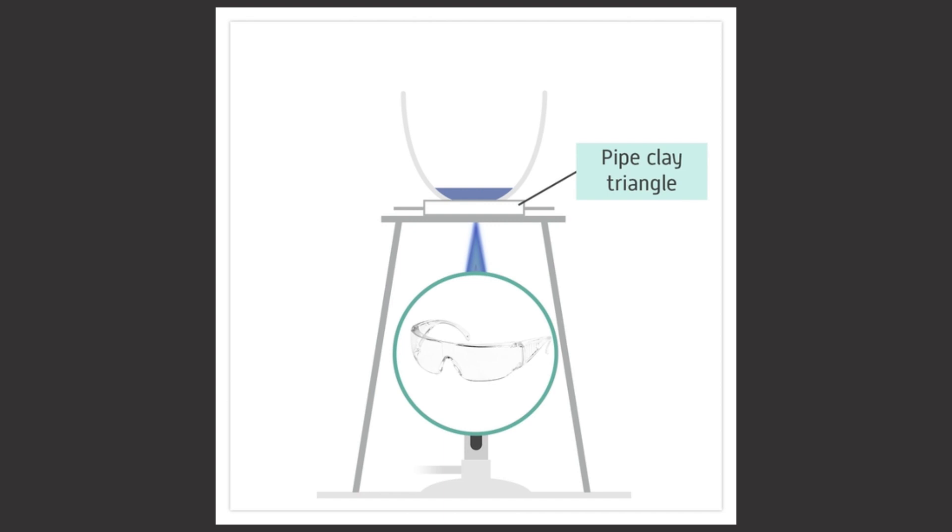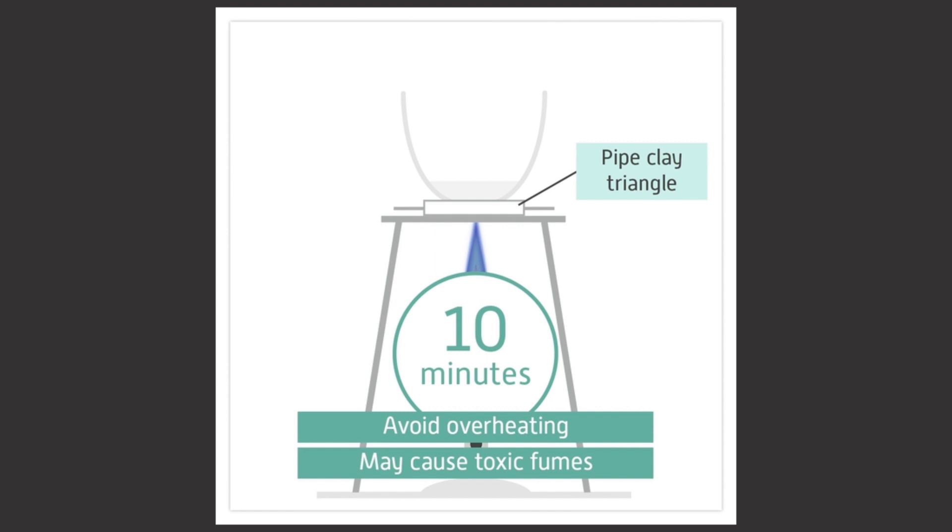Carefully observe the solid, making sure you wear eye protection, and keep heating until the solid has completely changed from blue to white. Avoid overheating, which may cause the copper sulfate to break down and form toxic or corrosive fumes. A total heating time of about 10 minutes should be enough.